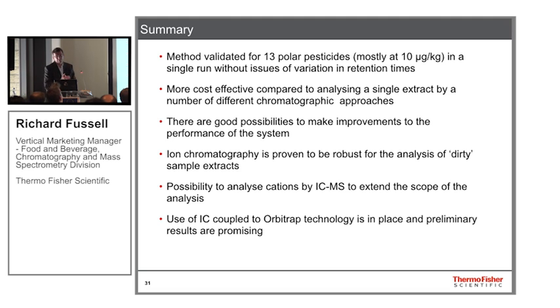So just to finish off, in summary, the method is validated for 13 of the polar and ionic pesticides, mostly at 10 ppb concentrations, in a single run, without any real issues of variation in retention time. And that's more cost effective compared to analysing a single extract by a number of different chromatographic approaches, which is what laboratories maybe tend to do at the moment.